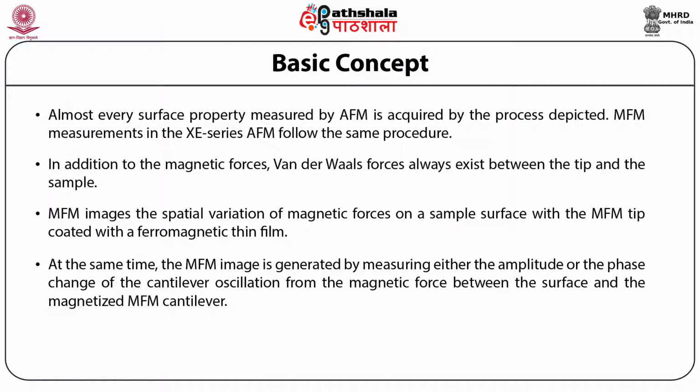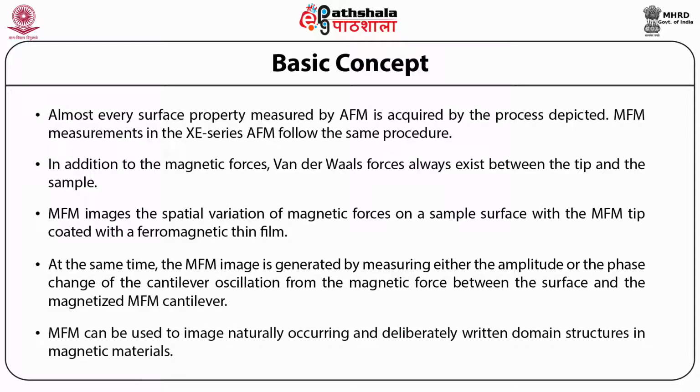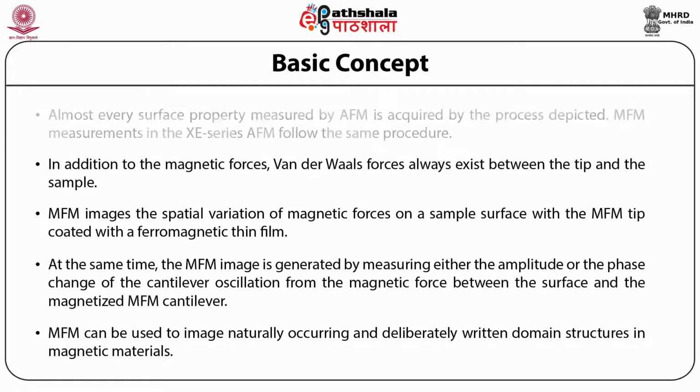MFM images contain information on magnetic domain distributions on the sample surface. MFM can be used to image naturally occurring and deliberately written domain structures in magnetic materials.